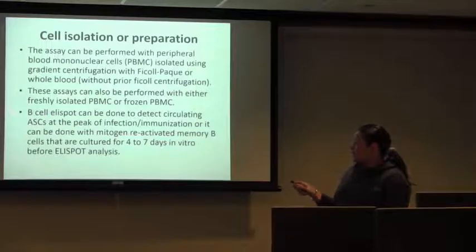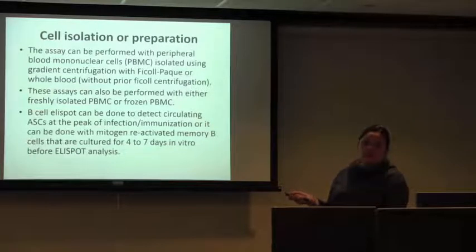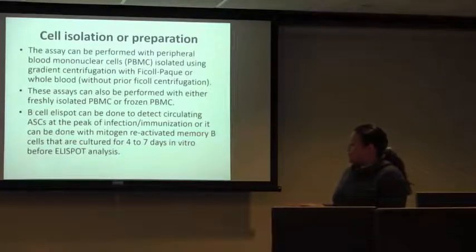One important thing is these assays can be performed with either freshly isolated PBMCs, or they can also be used with frozen PBMCs. They have done comparisons and both of them work fine, especially for antibody-secreting assays.